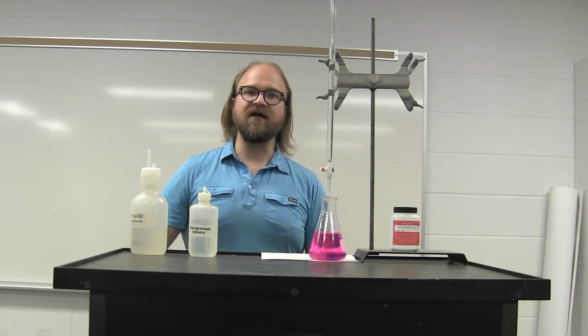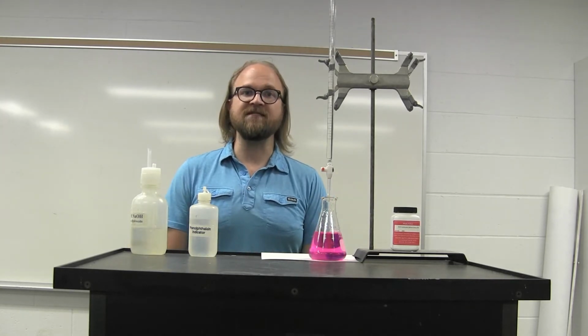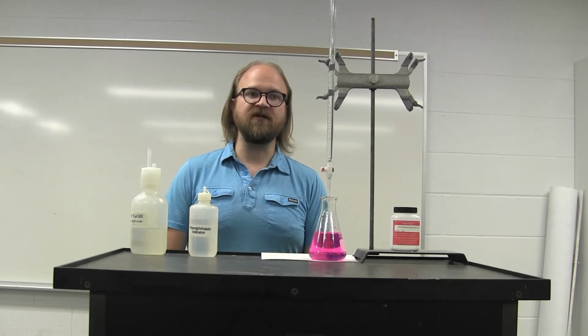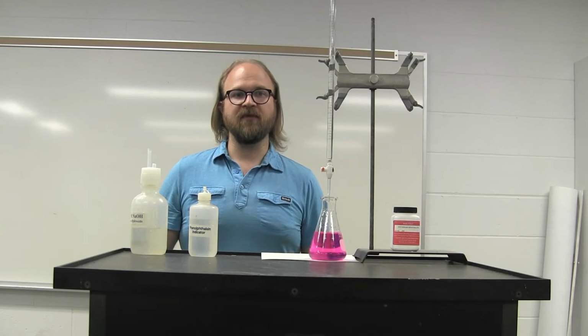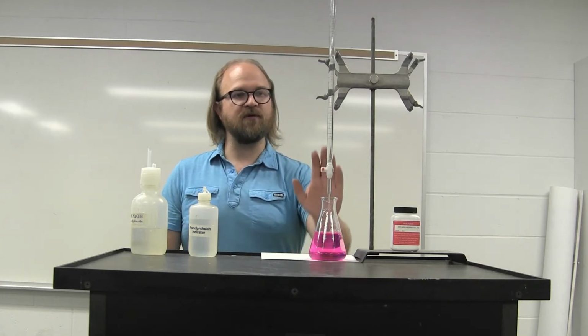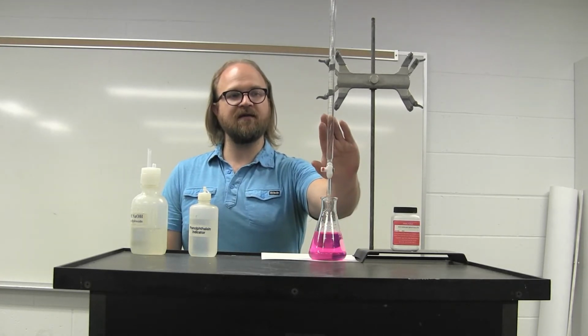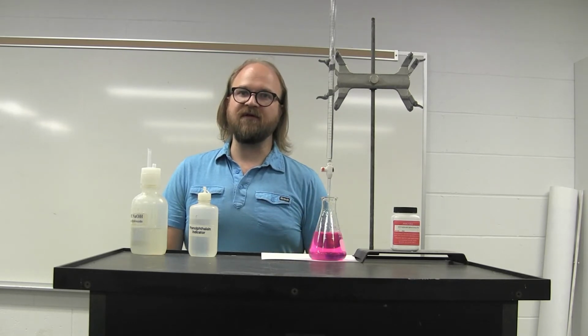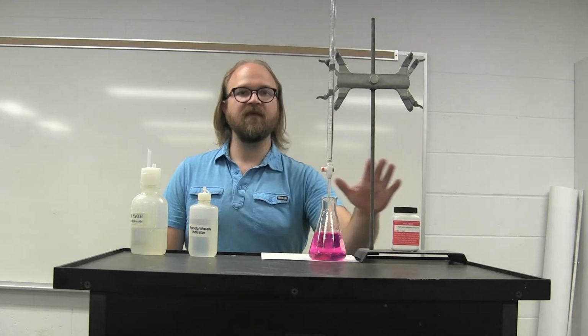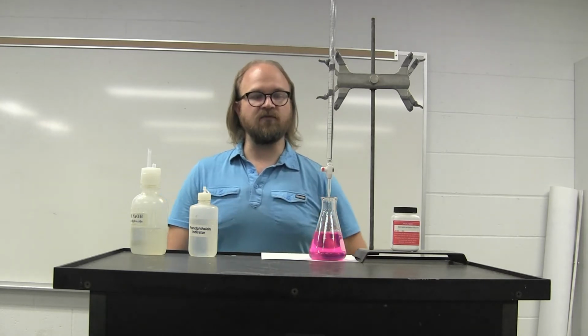The sodium hydroxide is a very precisely known concentration, and you'll very accurately measure the volume. In this way, you can determine the moles of sodium hydroxide that you add, use the stoichiometry to figure out the moles of acid, and based on the volume, you can determine the concentration.